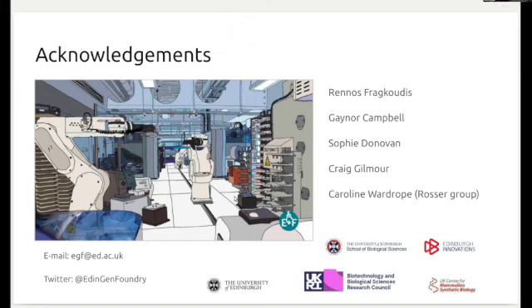And just one question about biosecurity screening. Just how do you stay on top of updating your references for that? Long answer. Yes, so there's an organization called the IGSC, which is the International Gene Synthesis Consortium, which is a trade organization of the various DNA synthesis companies, and they have a reference database that they share between each other, and this is how we update the references. So it's like a community effort, more or less. So access to a community resource, great.